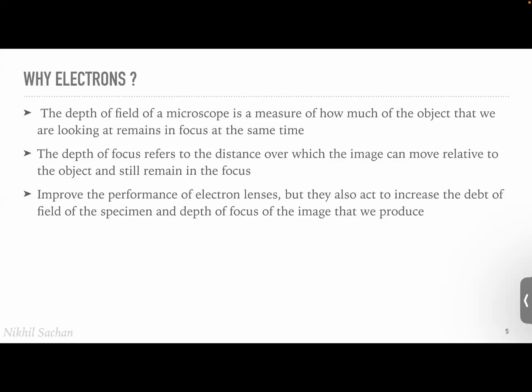In a light microscope, we are using a light source only, but because of lenses, we are magnifying our image. True. So there are two reasons. We can only see in the visible range. Moreover, our eye cannot magnify beyond a limit, because different creatures have different magnifications; they don't see in the same aspect ratio as our eye sees. So both things play a role: the magnification limit of the eye, as well as the fact that we can only see the visible range.